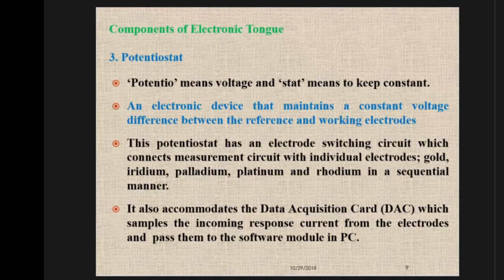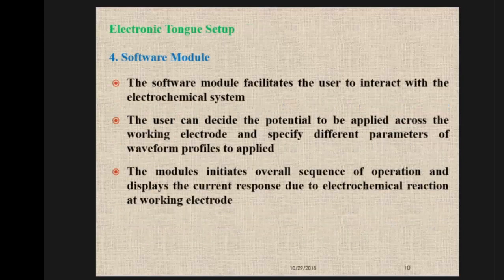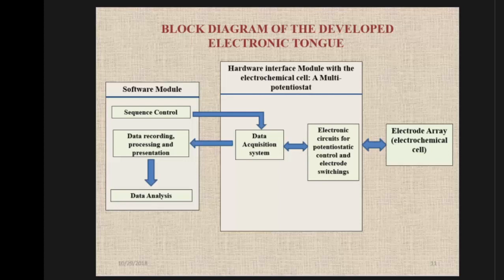It also houses one data acquisition system which has been developed in-house, and then an in-house developed front-end interface for controlling, sequence control operations, and rendering of the response. So this is a software module which has been developed. The job of the software module is to initiate the operation and pass on the starting parameters to the microcontroller in the data acquisition system, and then once the responses are acquired, we can plot them. And of course, data logging is supported.